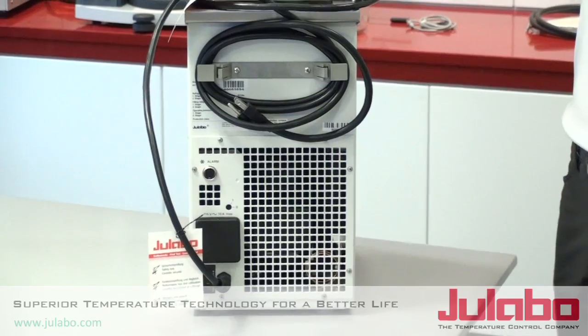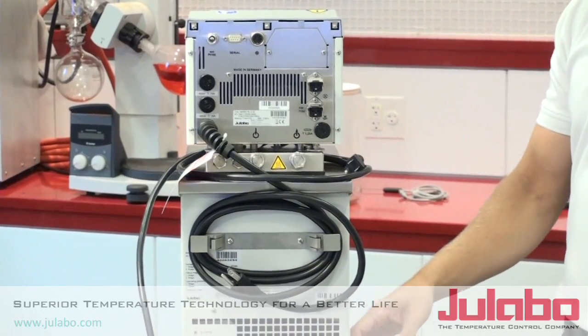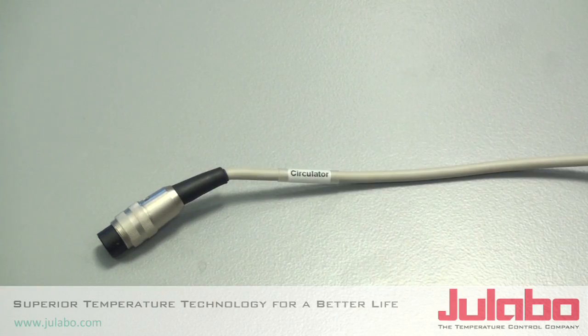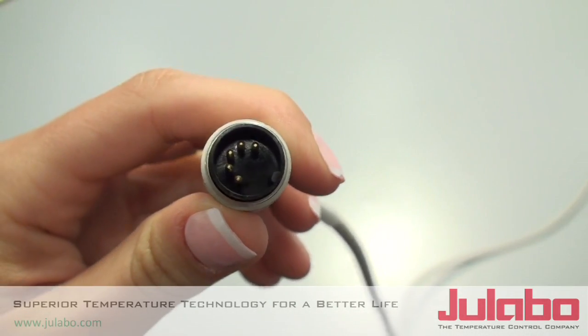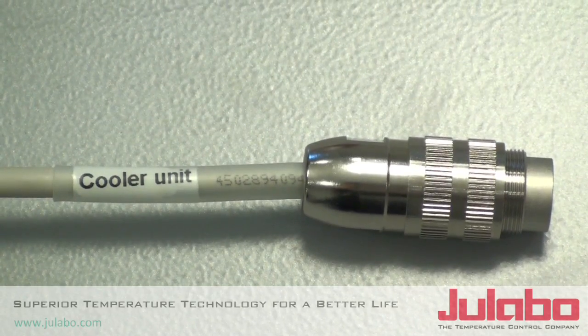Next, we want to make communication from our circulator head to our refrigerator portion here. So what we call an alarm cable will initiate that communication. Be careful — this has two endings: one designated for the circulator and one designated for the cooler unit. These go in and they need to be tightened down.